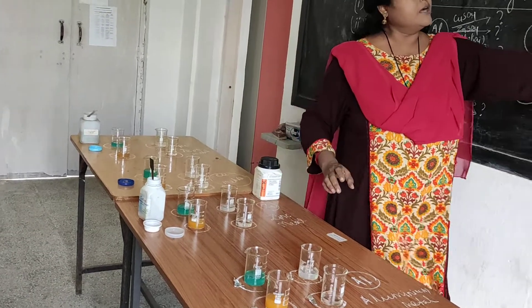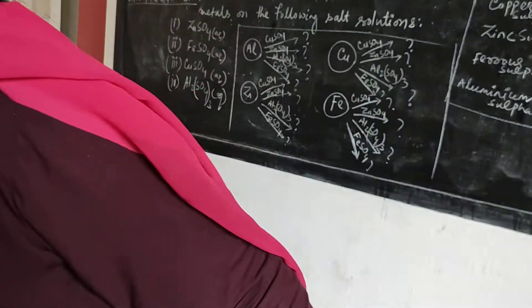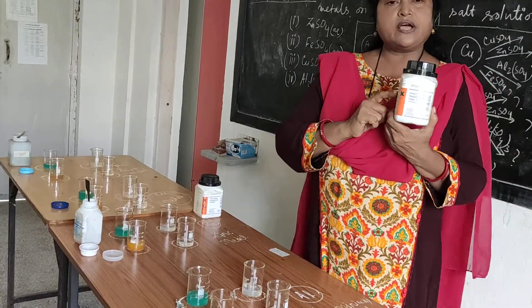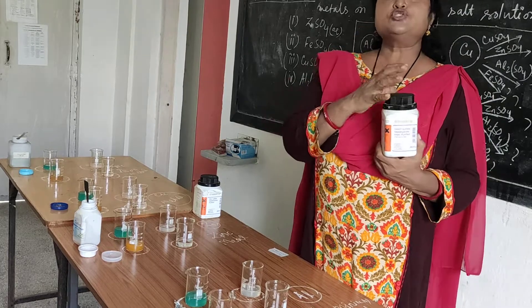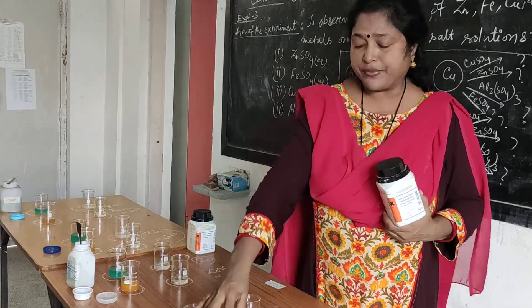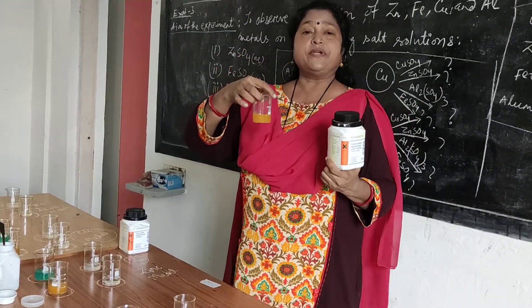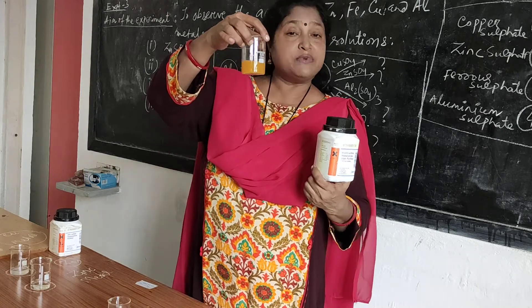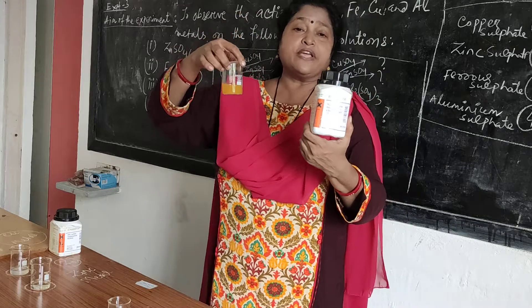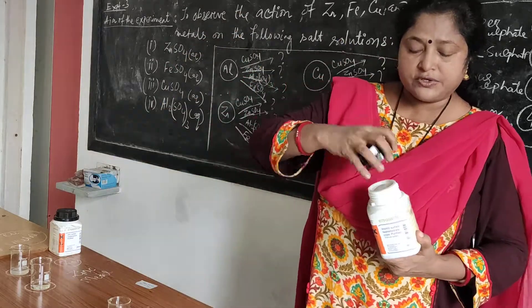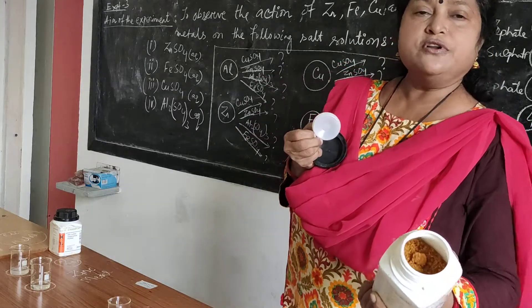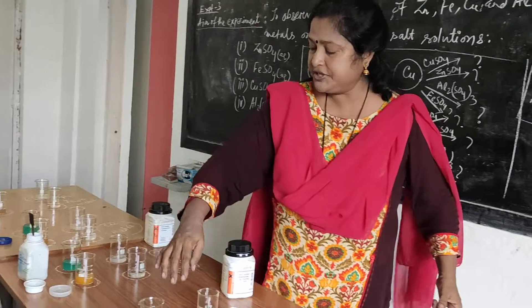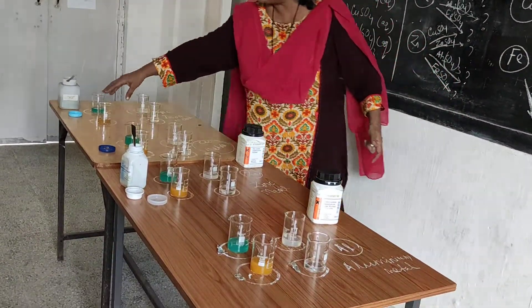The third beaker for each table is iron sulfate. You see iron sulfate solution. Because the iron sulfate is changed to ferric sulfate by exposure to the atmosphere and sunlight, we are getting a brown liquid here. Instead, if it were ferrous sulfate, we would have got a sea green color. It is now ferric sulfate — an atmospheric oxidation has occurred. So I have taken ferric sulfate solution for beaker 3 at each table.